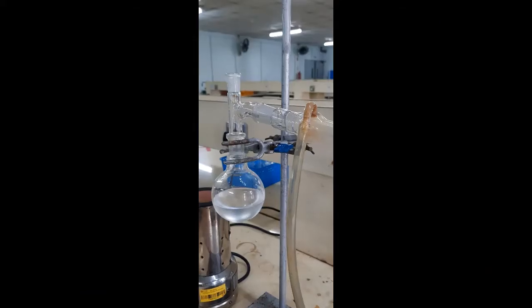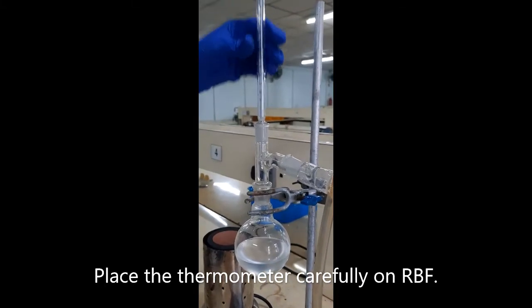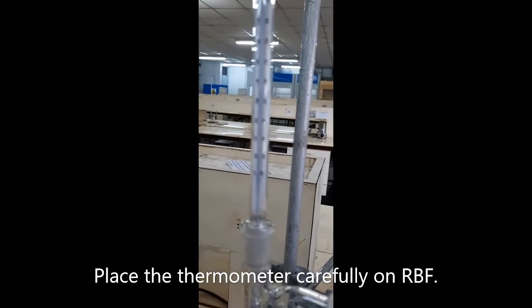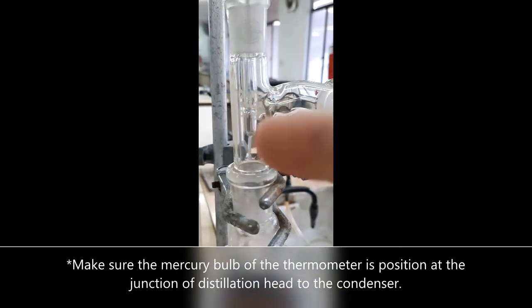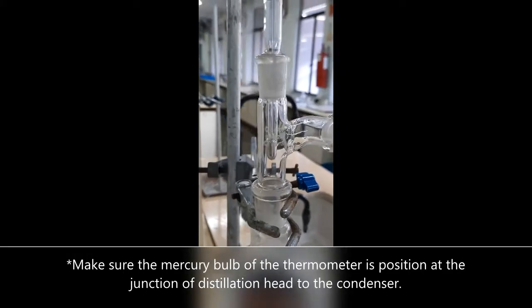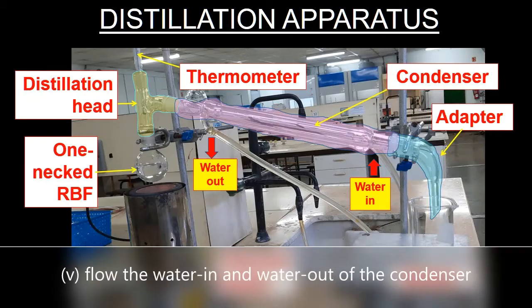The bottom of the thermometer should be at the junction where the adapter meets the condenser. Ensure the mercury bulb of the thermometer is positioned at that junction. Next, turn on the pipe water. Water enters the condenser from the bottom and exits at the higher end.